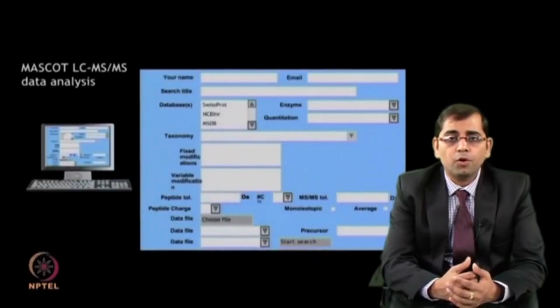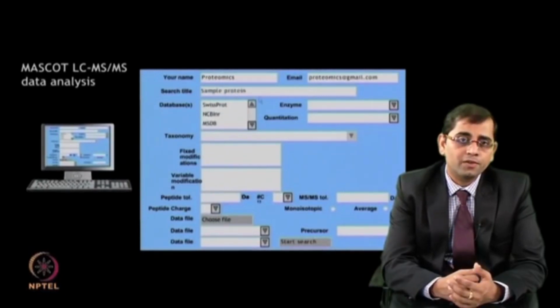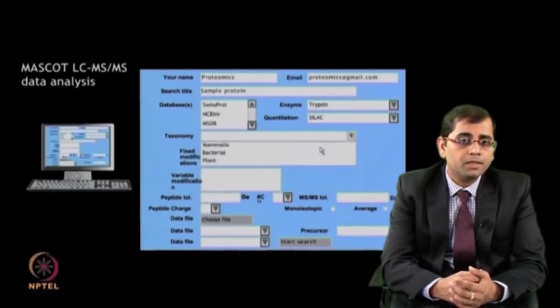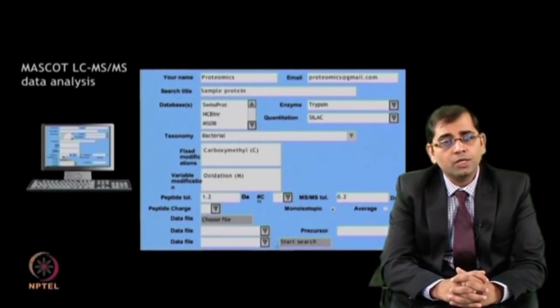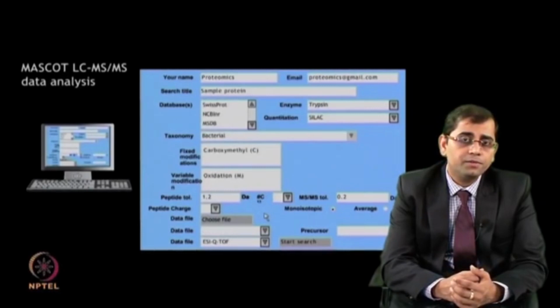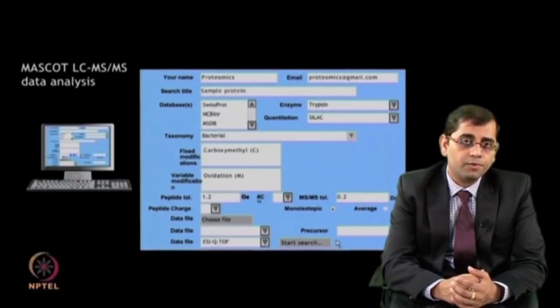Data analysis is an important step for protein identification and quantification in the proteomics workflow. The accurate quantification of protein abundance becomes very important for quantitative proteomic analysis. This lecture will focus on data analysis for protein identification using Mascot and protein quantification using an iTRAQ based workflow.